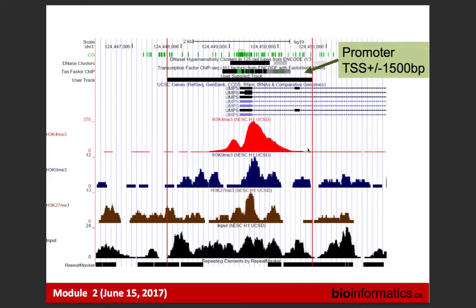So it's quite a few of those bins, right? 3 billion bases divided by 3 kb is 1 million. A little bit less than that, because some of it is unmappable. And then we compare distributions.